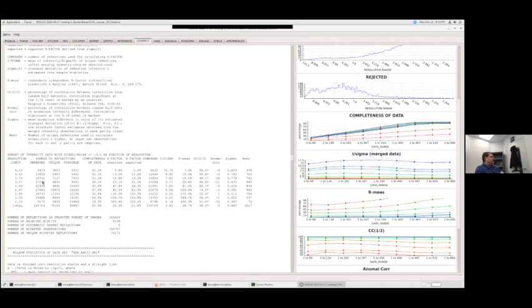And what it's doing is it's actually breaking the diffraction pattern down into shells that have a roughly equivalent number of observed reflections. Okay, and so you can kind of see that here. These values are roughly equivalent. So this is the number of observed, the number that are unique. Observed includes all the reflections. Unique is the subset where, if I have two that are symmetrically equivalent, in the unique count those only count as a single reflection.